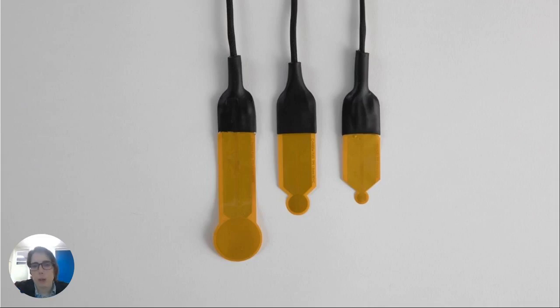One of the reasons why we call the flex method flex is because of the range of sensor sizes available. So rather than trying to force your sample to conform to the sensor size, in this case, you have the flexibility of choosing the sensor size that fits the sample. The smallest sensor size here is appropriate to very small samples.